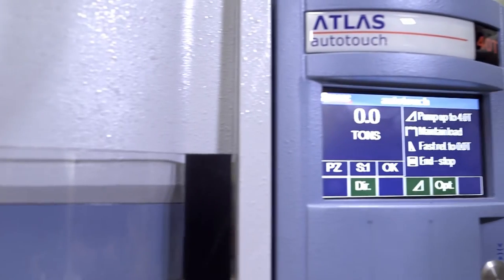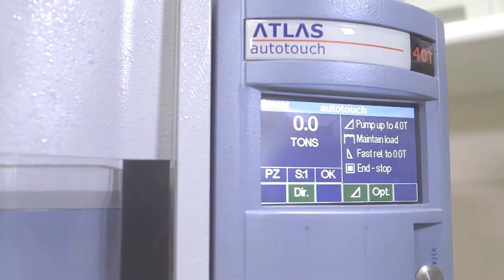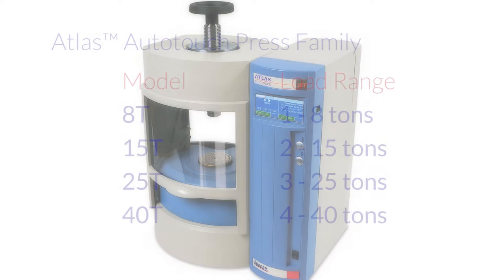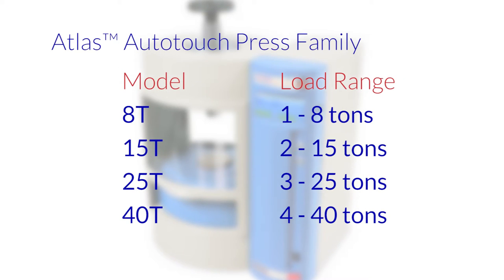My name is Jim Williams, part of the sales team here at SPECAC. The Atlas Autotouch presses are fully programmable with power-assisted hydraulics that cover a wide range of tonnages. We can supply presses up to 40 tonnes or as low as 8 tonnes.